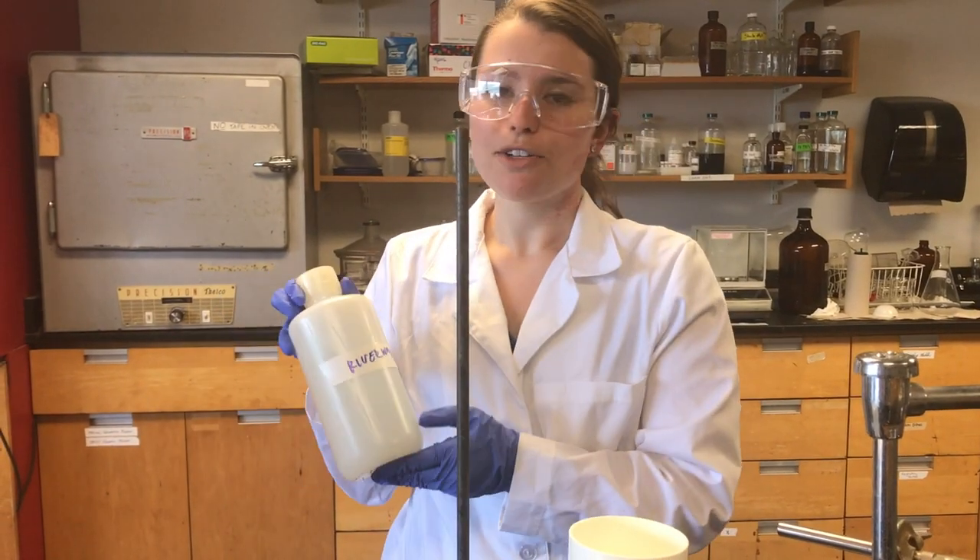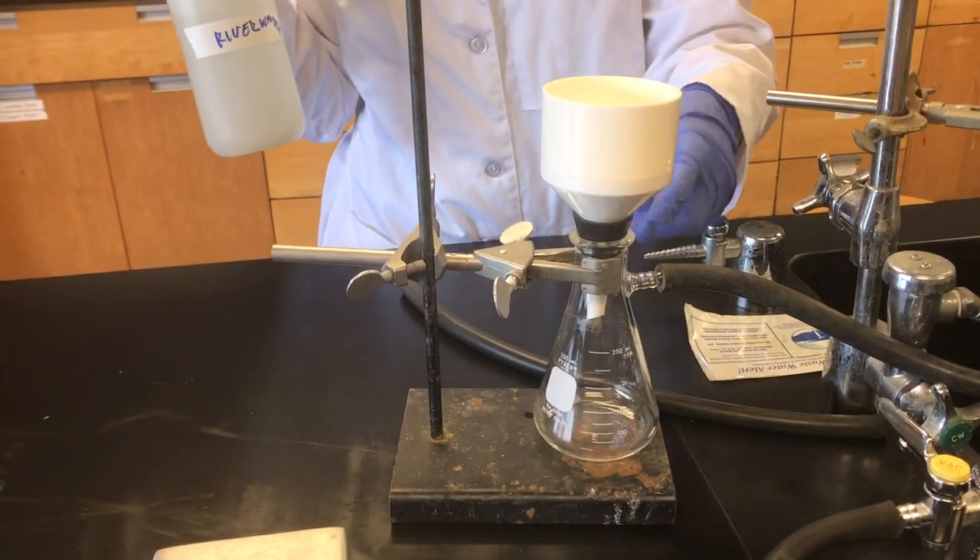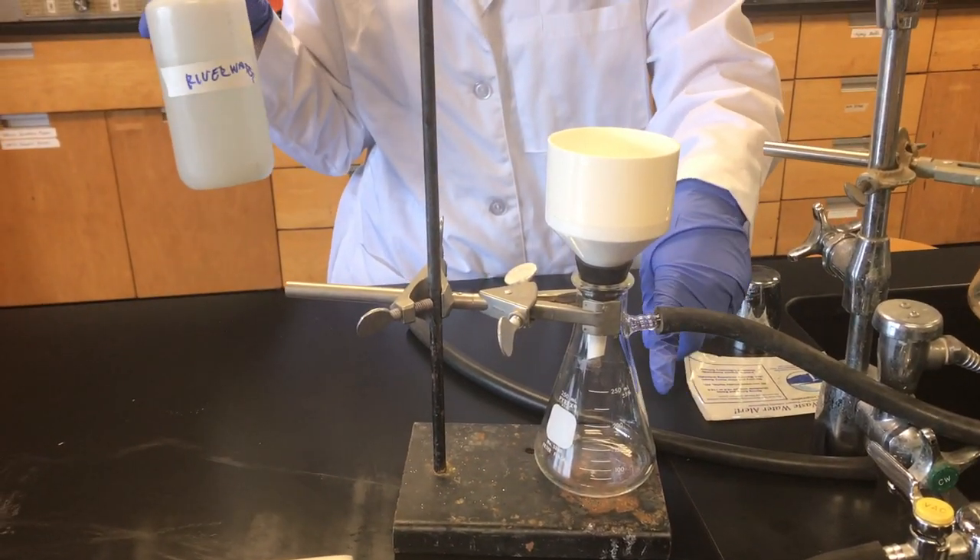Now that you've collected your river water, we're going to filter it in the Büchner funnel. You're going to want to make sure that the filtrate that comes out is as clear as possible.